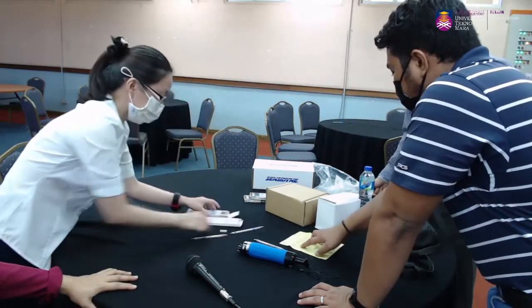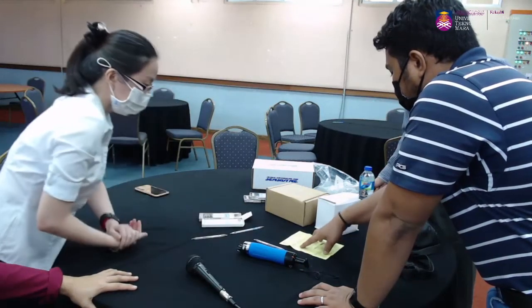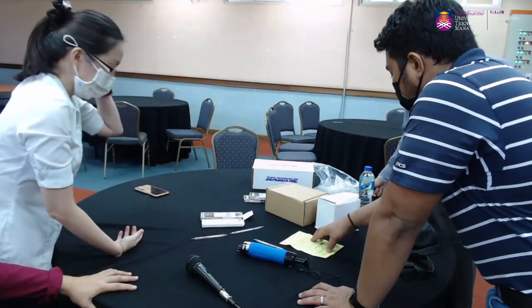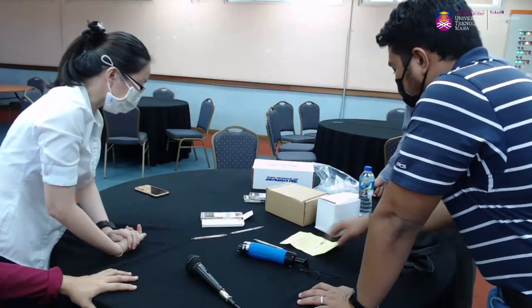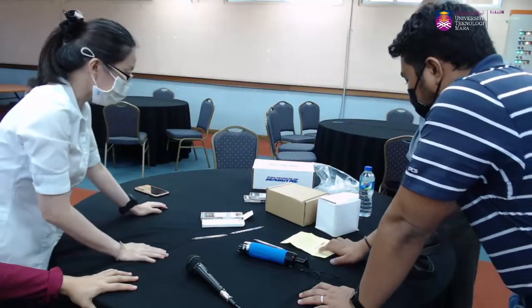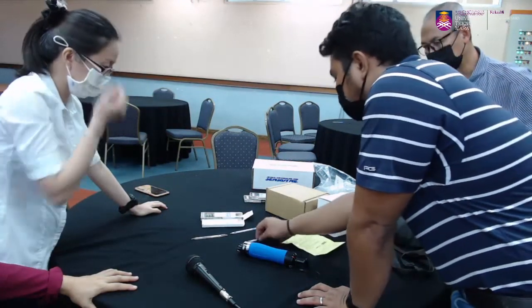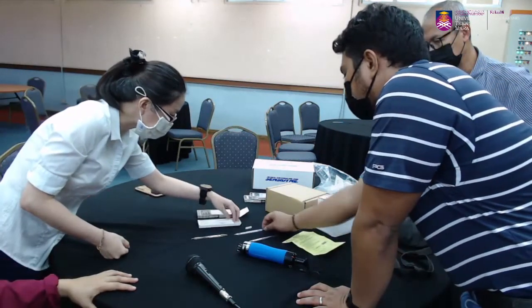Okay. Detector tube contain chemical reagents. Do not touch the reagents directly once tubes are broken. Keep the tubes out of reach of children. So kita kena baca sebab kita kena tahu apa yang perlu kita pakai dan kenakan. Daripada sini one part kita ialah this one, and the other part is kita punya reagent, this one lah.